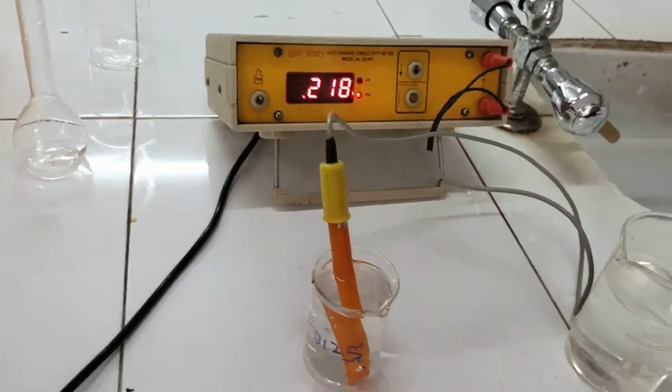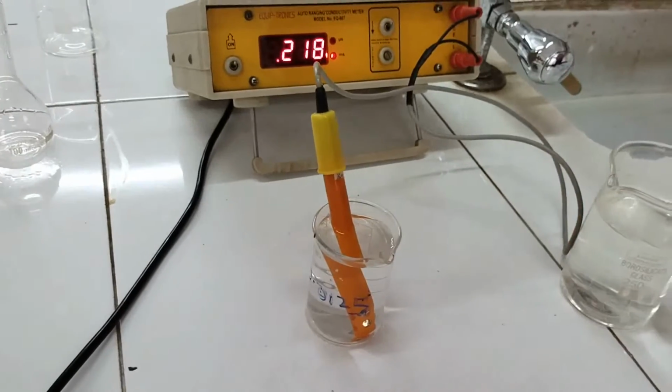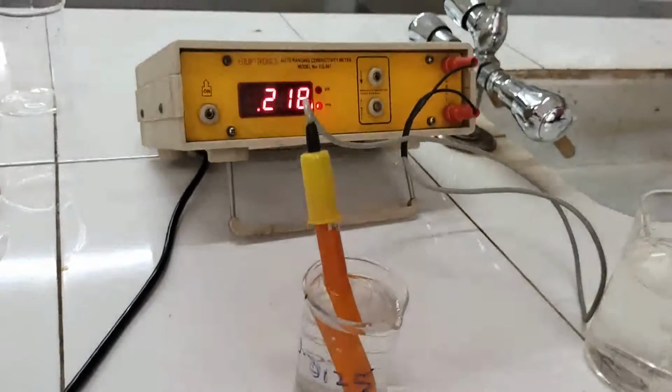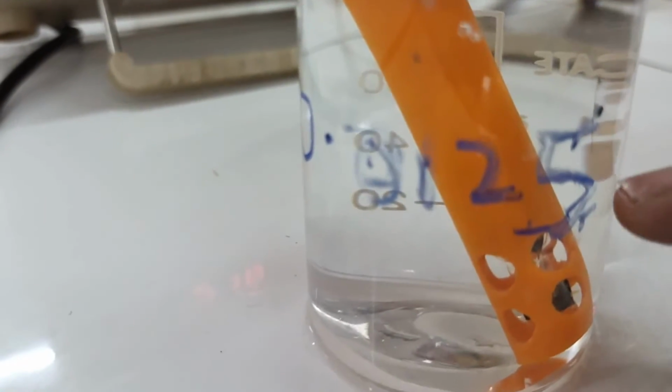Of course, one more thing I want to tell you is, it's not necessary to take the entire 100 ml solution. Okay, please be very clear. The volume of the solution should be sufficient that only this bottom portion, can you see this, the parallel plates of the electrode, only that has to dip into the given solution.